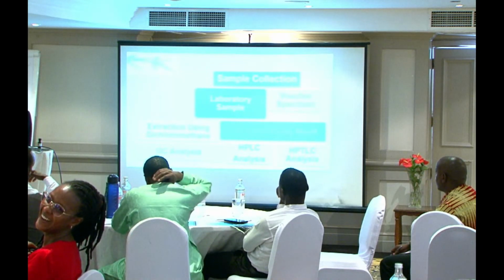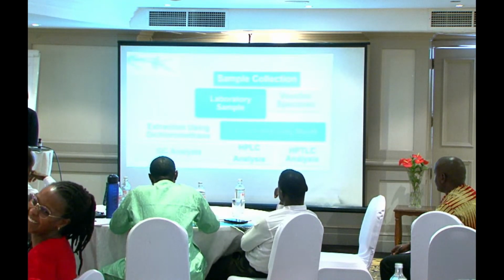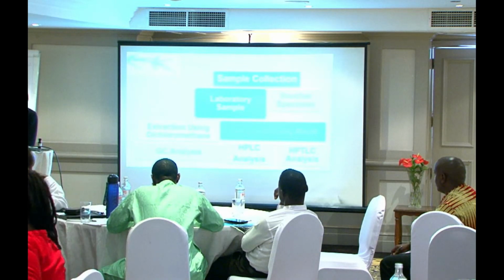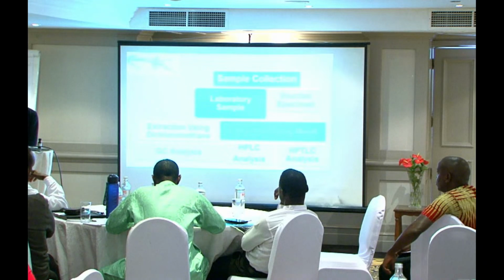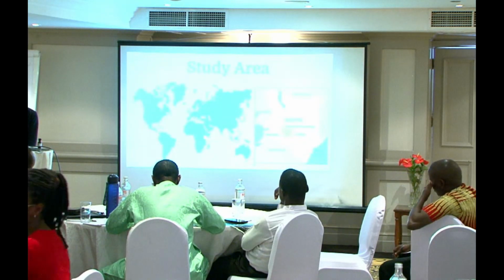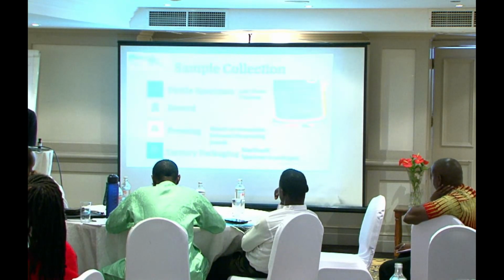After sample collection, I helped with a lot of you all's plants with the pressing process. We did a lot of the extraction. We used methanol for the extraction. We did GC, HPLC, as well as HPTLC analysis. And here's a map of where Thika is located within Kenya and the sample collections.